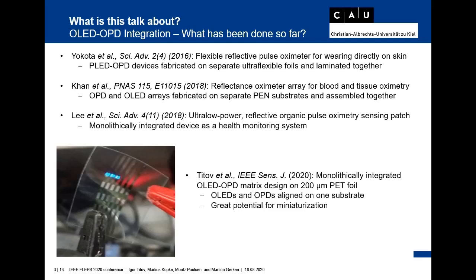As you can see, the device is flexible due to the 200 micrometer thin PET substrate, which was integrated with a PDMS chamber for sensing and fluidic applications. The system has a great potential for miniaturization and serves as a platform for several measurement approaches like sensing with reference signals or the redundancy approach.